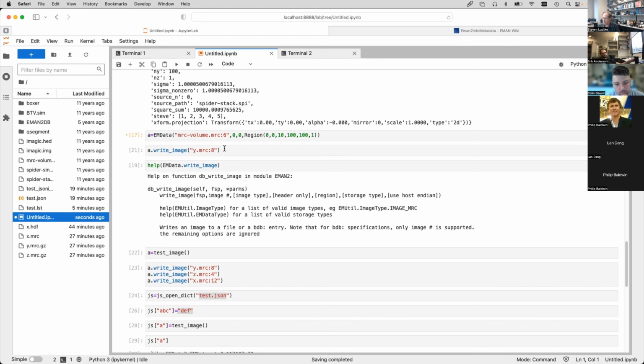And then people are writing their own commands, activate EMAN2, activate Spider, activate Relion, which would then change their shell variables. Anyway, Anaconda is basically a simplification of that process. So yeah, you have to have Anaconda activated to call EMAN2 scripts. Okay.